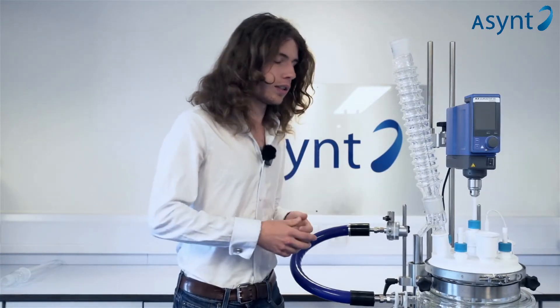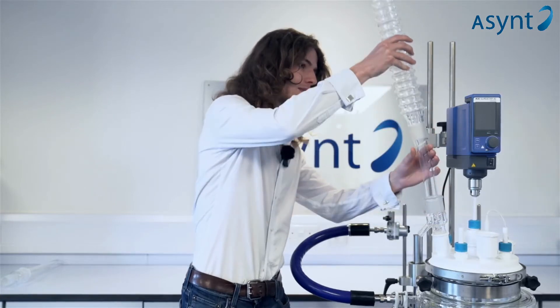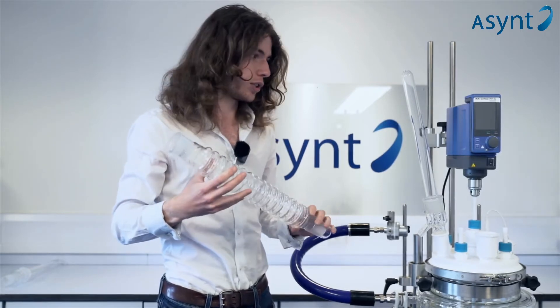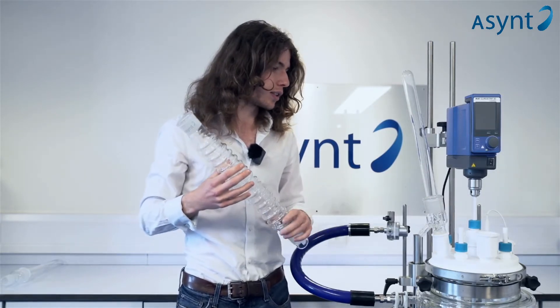Just like the normal condensing, it's a waterless condenser, but this one comes in two parts. It's got the outer layer, which is very similar to the original condensing. It has the ribs for increased surface area and more turbulent airflow, which increases the condensation. This one has the inner section as well, which forces the air closer to the outer layer and increases the surface area a little.